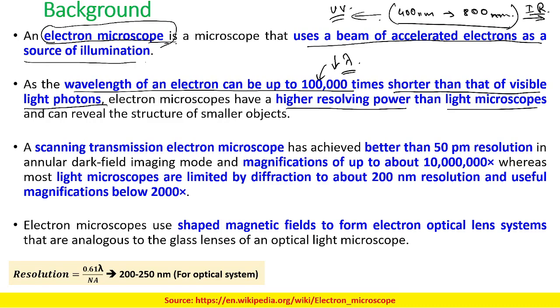If you put an IR source, it will be invisible to you, but if you put it on your camera, you will find that you are getting the image. That is the reason why you are getting the image. So there are certain cameras which do not have IR filters in front of them. Now I hope it is clear.